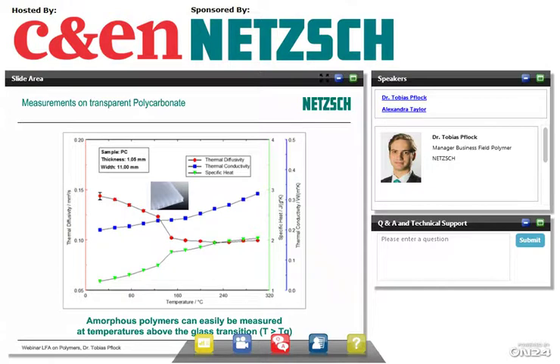So we coat this with graphite in order for the sample to absorb the flash pulse and to measure the thermal transport. Well, what you see here is actually a typical plot as we plot the parameters that we get from the LFA. On the left axis in red, you can see the thermal diffusivity. This is the sole property that comes from the laser flash.